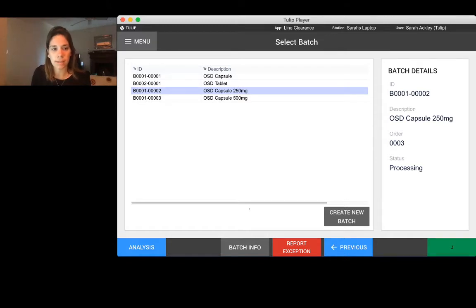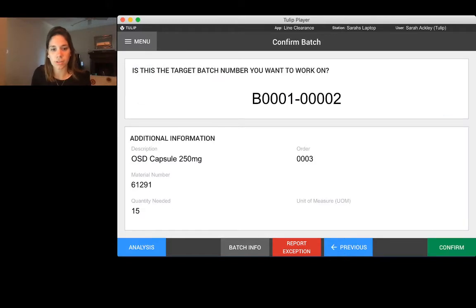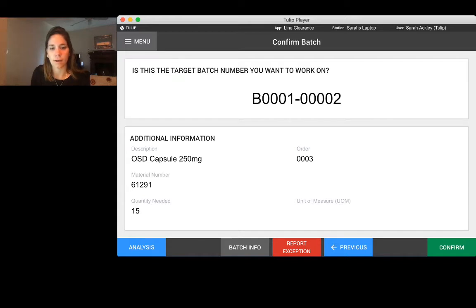So we go ahead and select a batch. You can see it's pulling the order that it's associated with, the material number, and the quantity associated with that order.